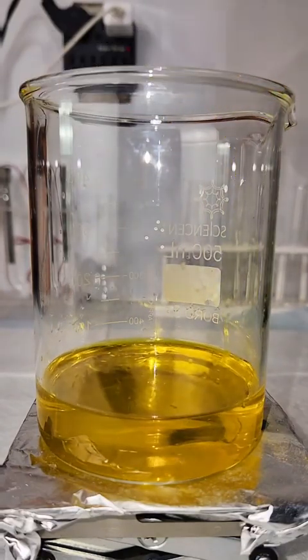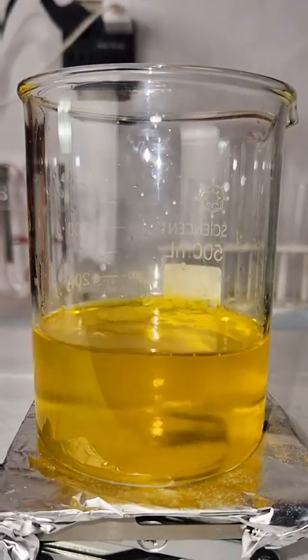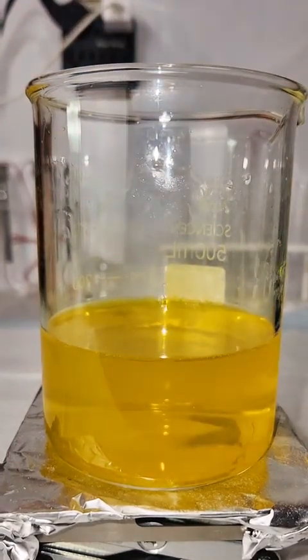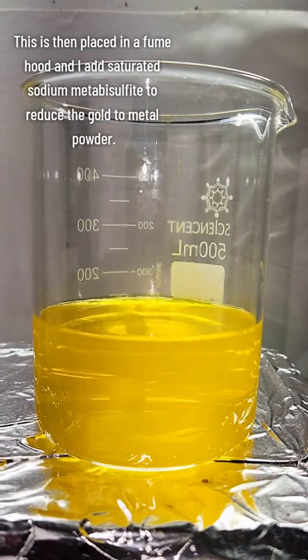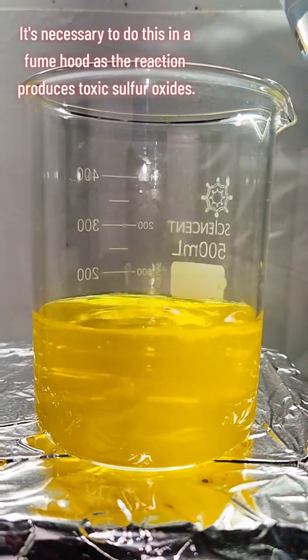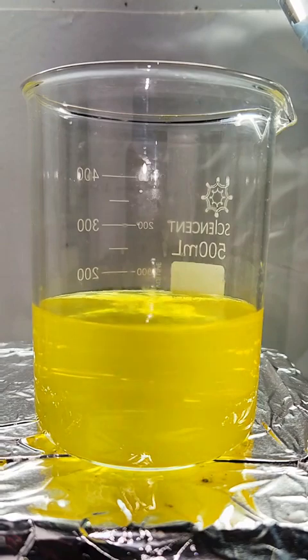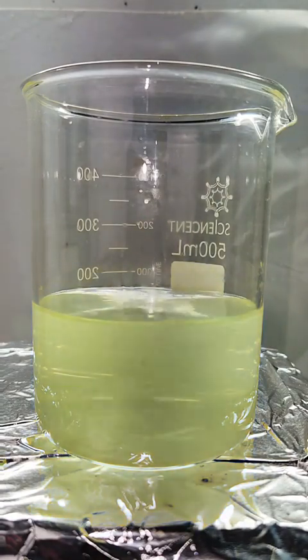To begin processing my chloroauric acid back to metallic gold, I start by adding a strong solution of urea to it, which will neutralize any residual nitric acid. I then transfer my beaker to a fume hood and slowly add a saturated solution of sodium metabisulfite, which is going to reduce the chloroauric acid back to metallic gold. This results in an immediate and interesting color change as the gold is precipitated out as an extremely fine powder.